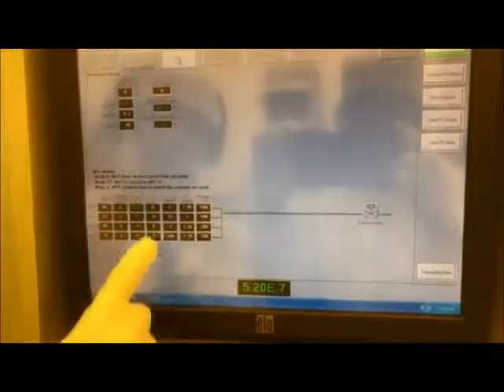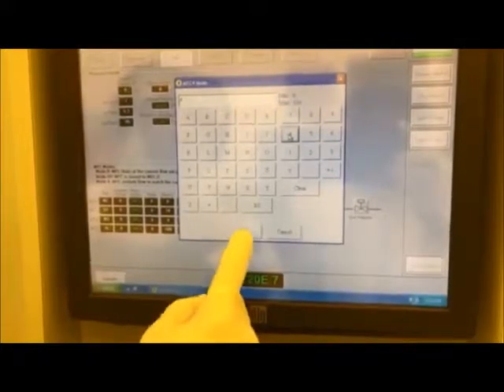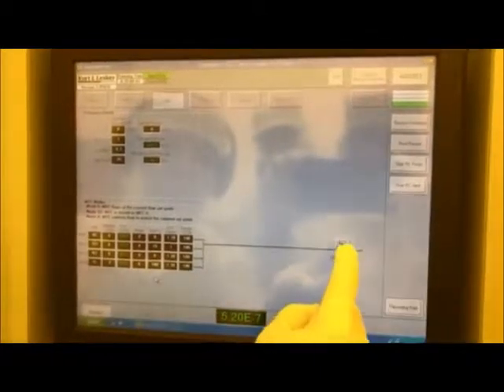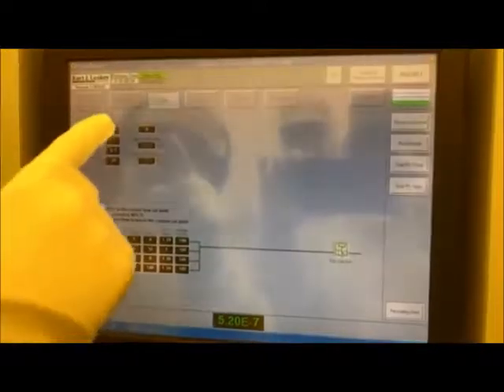I'm going to press mode. We change the mode from 0 to 4, which is a memorized recipe for a certain flow rate and certain pressure. Once we set the mode, we will kick gas injection to start the gas injection. And then we will go to the deposition panel and set the pressure.